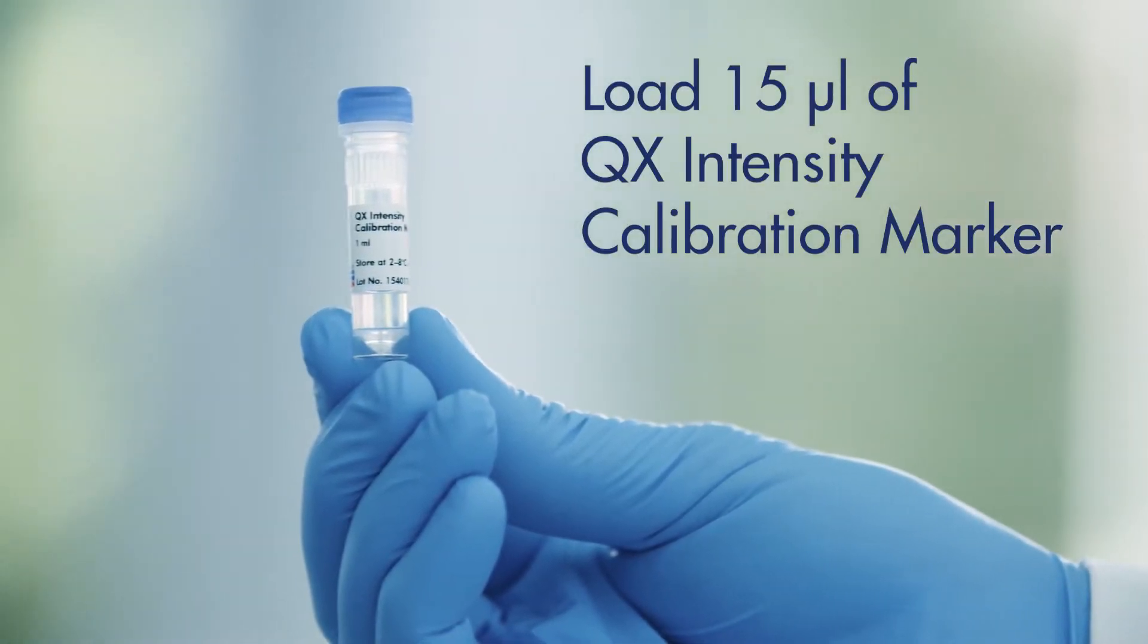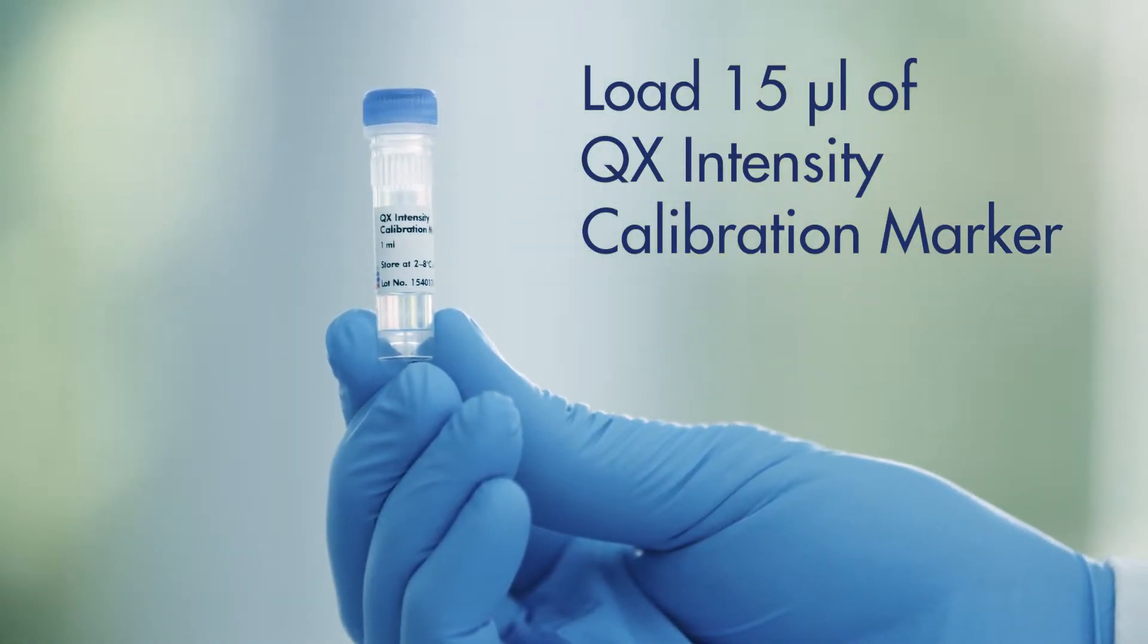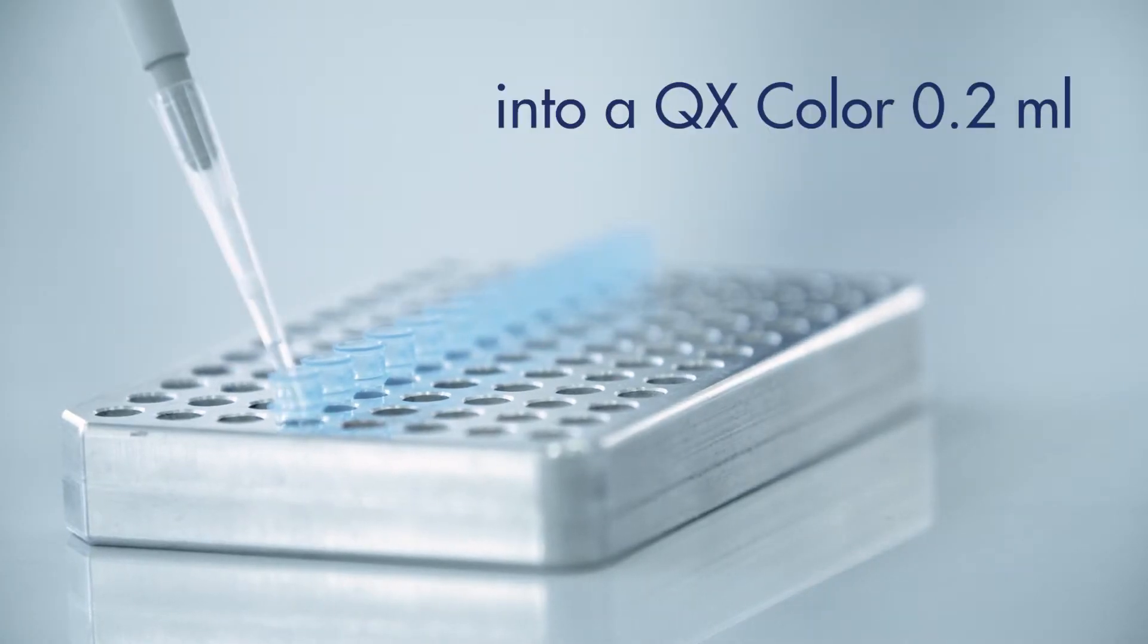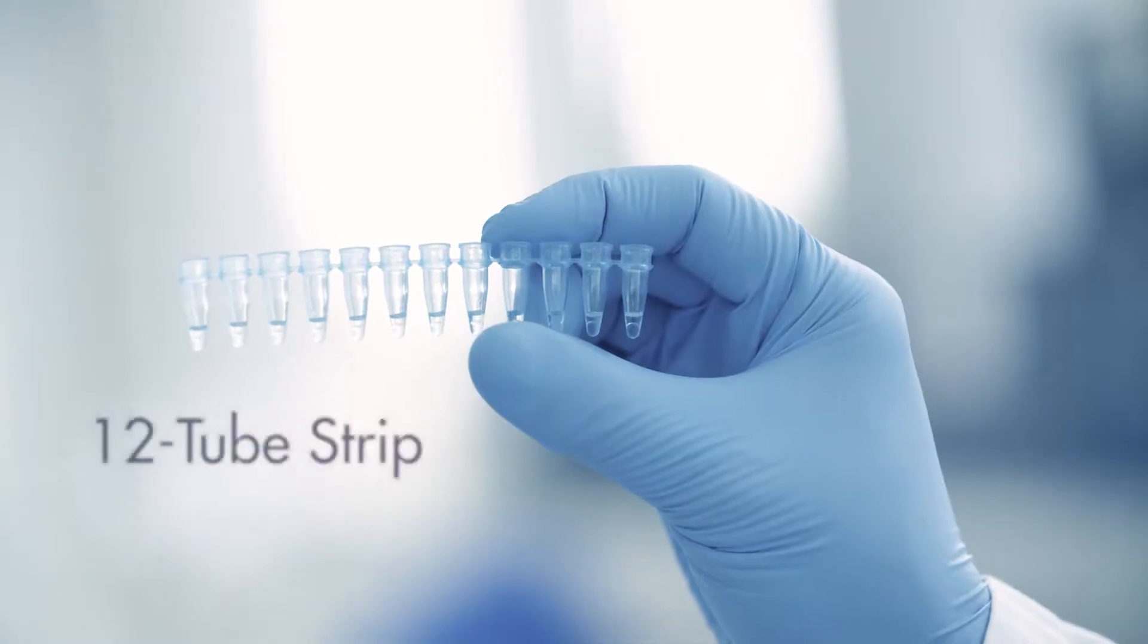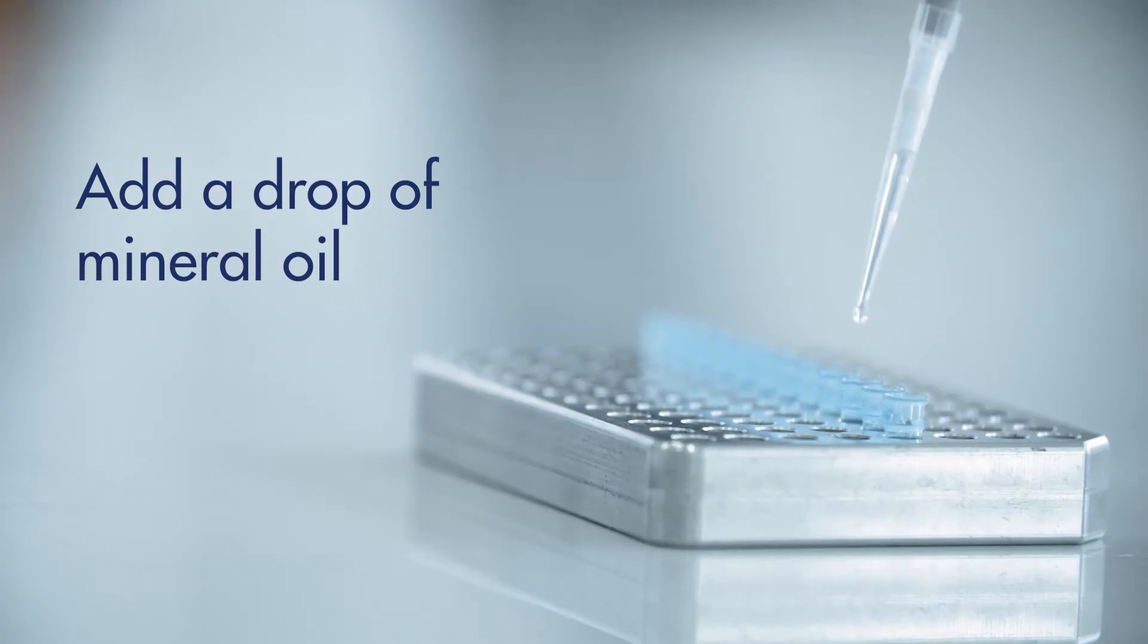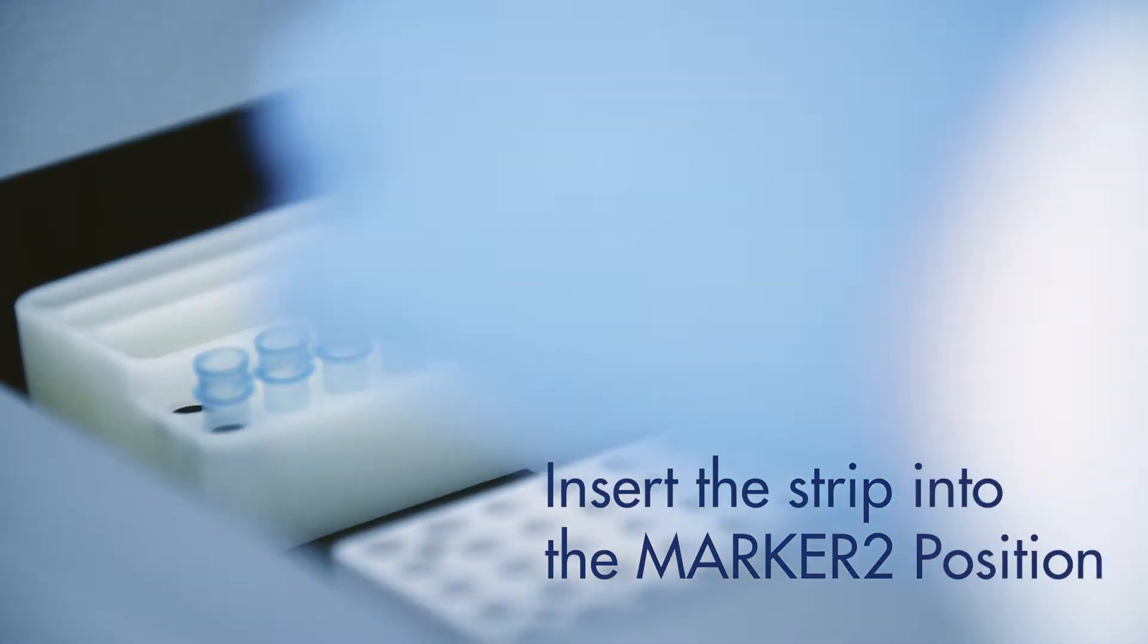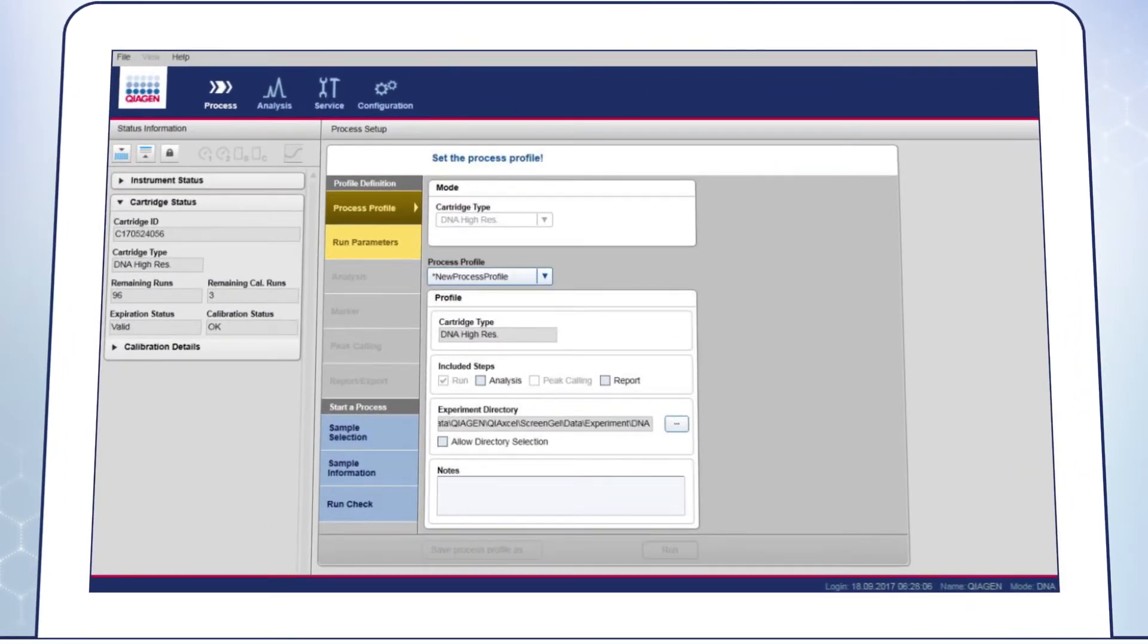For signal check, load 15 µl of QX Intensity Calibration Marker into a QX Color 0.2 ml 12-tube strip. Add a drop of mineral oil and insert the strip into the Marker 2 position of the buffer tray. Go to the Process Environment.